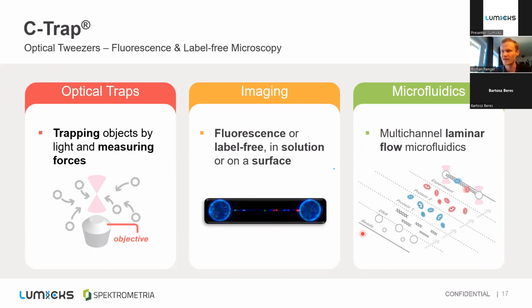experiment. So what you can now have is, for example, you have one channel with a solution that has plastic beads inside. You first go here with your two optical traps. You capture two plastic particles. Then you go to the next channel, which is just close by. So basically within a part of a second, you can go to the next channel, catch a DNA molecule that can specifically bind to your beads.